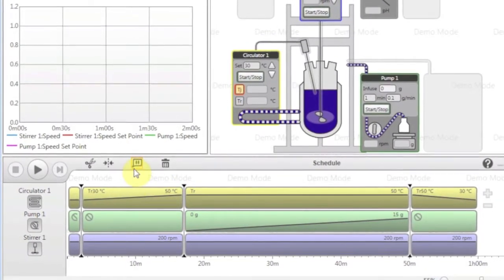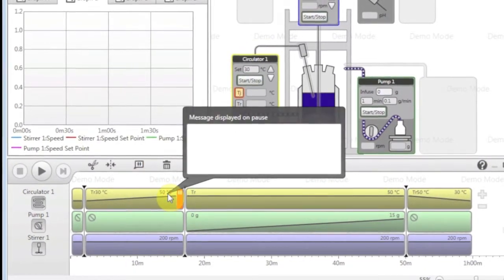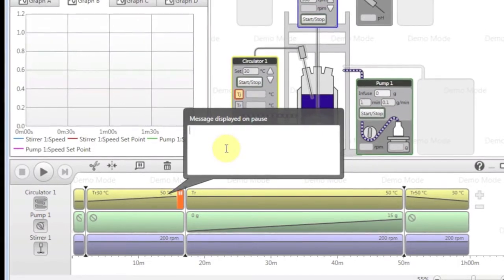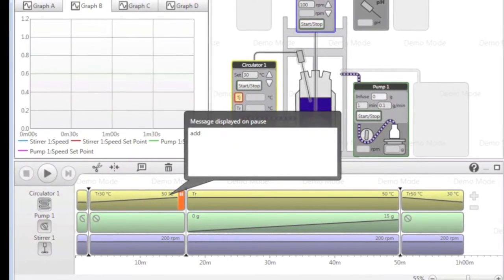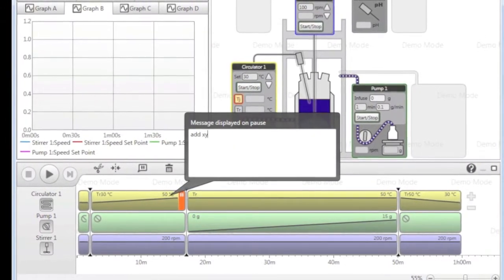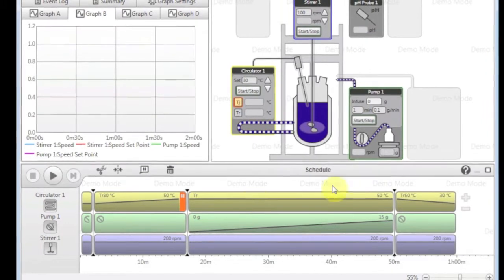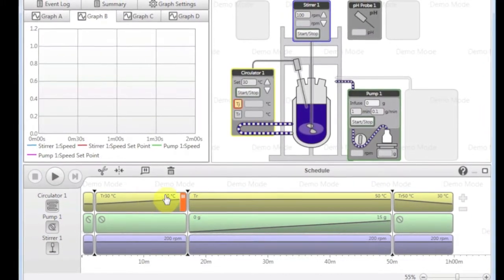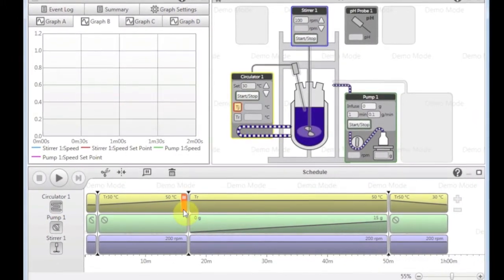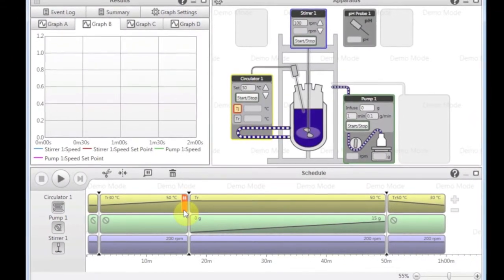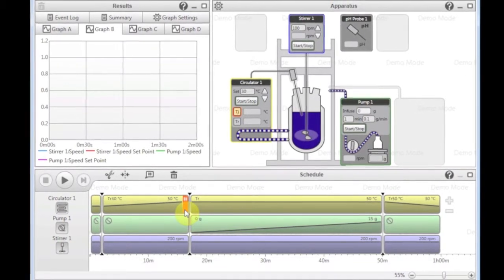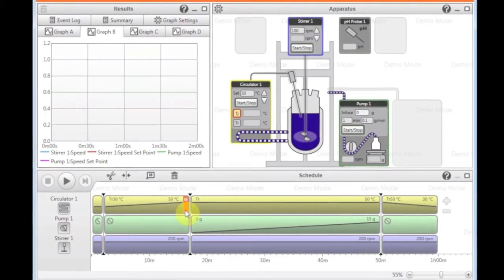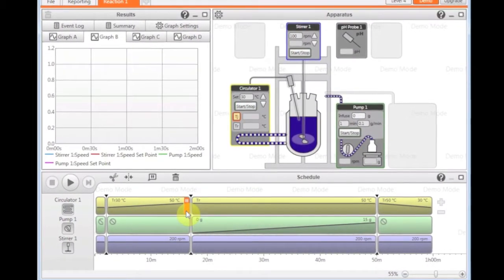I can also add a pause step. Say for example, I need to add something here before the hold phase. What it will do is it will make its way through this step. Once it's reached 50 degrees, it will display a message on the screen and wait for me to physically allow it to continue.